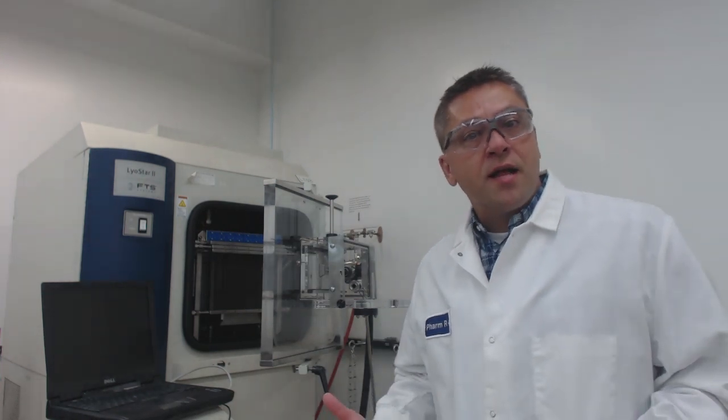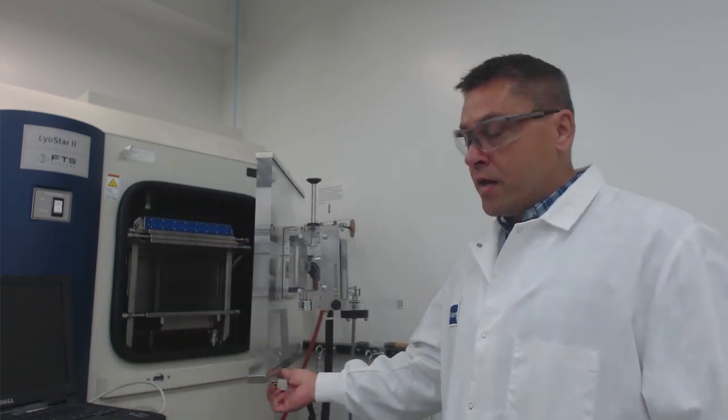Before we move on, let's first understand a little bit about the lyophilizer itself. I'm going to bring you a little bit closer to the lyophilizer. This is a laboratory-scale lyophilizer. You'll see it as a door with another chamber on the front. Inside, this is the product chamber. There are three shelves to a product chamber.